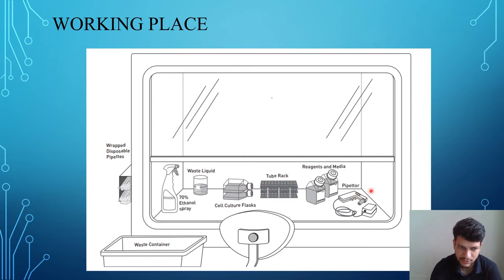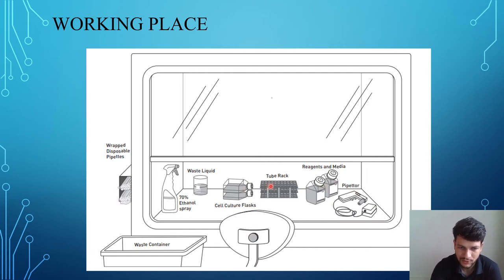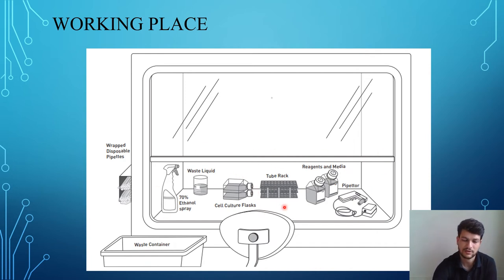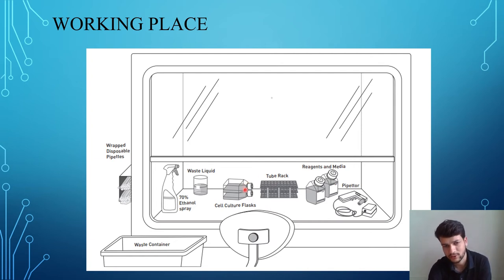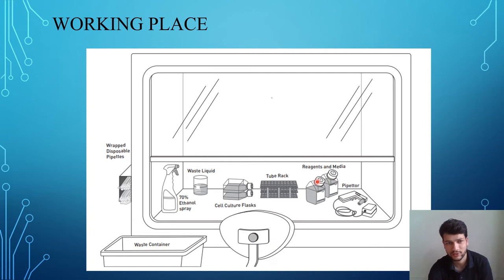This is the waste container for discarding waste. This is 70% ethanol for spraying. All these things should be inside the hood and wiped with ethanol before putting them in. This is the tube rack, these are the cell culture flasks, and this is the pipette used to remove or add media in the flasks. All procedures in cell culture are only done inside the hood — you don't have to open the lids of flasks or media bottles outside the laminar airflow.